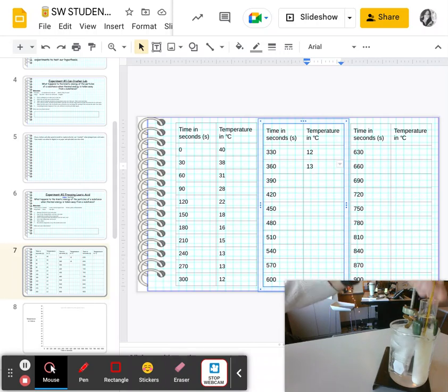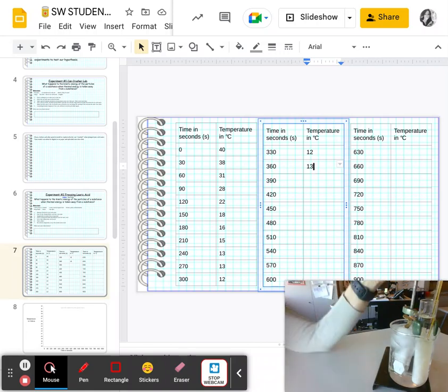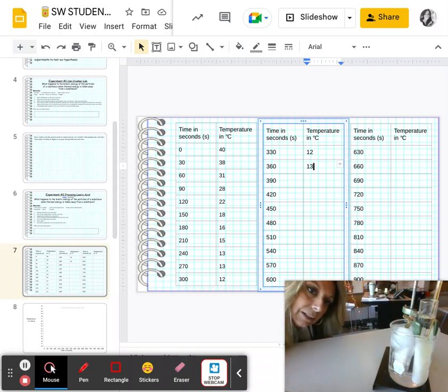All right, we can see it's becoming really opaque now. This is becoming a white substance there. I can feel when I press the thermometer down in there, it's kind of sticking to the substance. Yeah. Well, it's still 13.